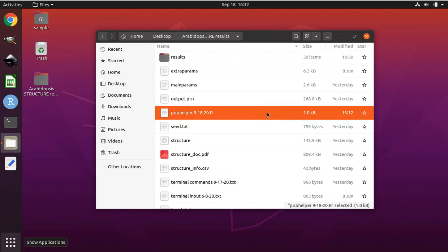Next thing to note, I have added an R script into this folder. If you were working with your own structure folder, following my tutorial before, but if it was based on your own data, and you were just trying to go ahead without using any of the tutorial data, you wouldn't have this R script in your folder.